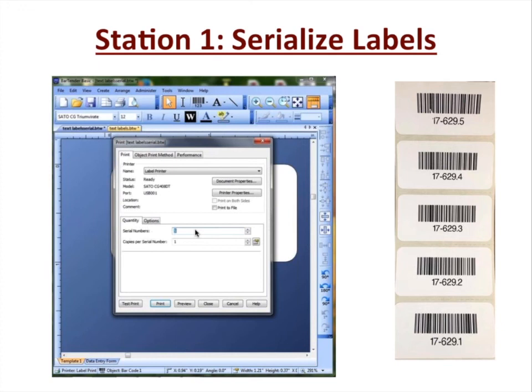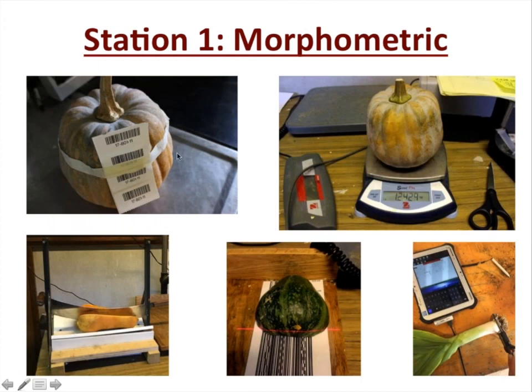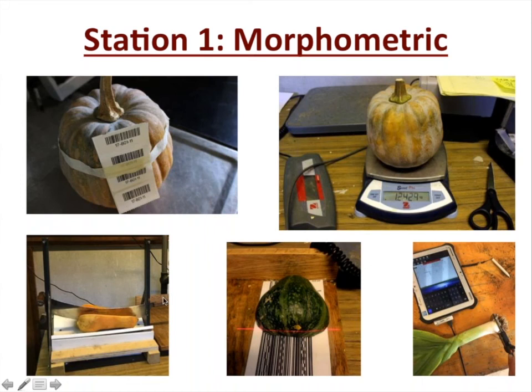As you have questions with this and go to implement it, there is another PDF titled 'Howdy' — the first word when you open the text file — that will take you through the steps specific to BarTender and how to get that set up. These labels are water resistant; we use a fluorotherm material now, and there are also different plastic labels if you need something more durable. So as the fruit comes in all labeled up and ready, after we scan it in, we put it on the USB scale, hit the print button, and the mass of the fruit is transmitted right into Excel.